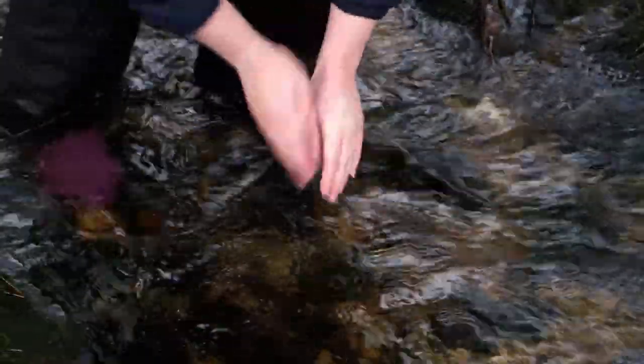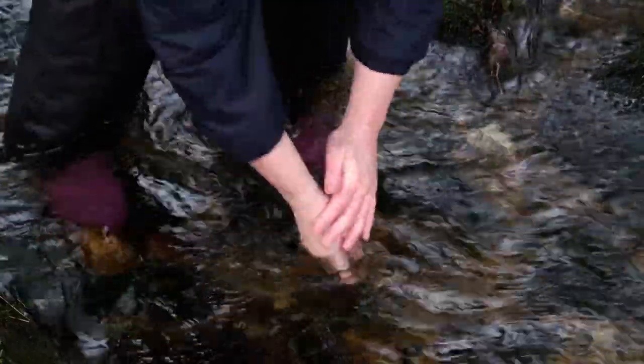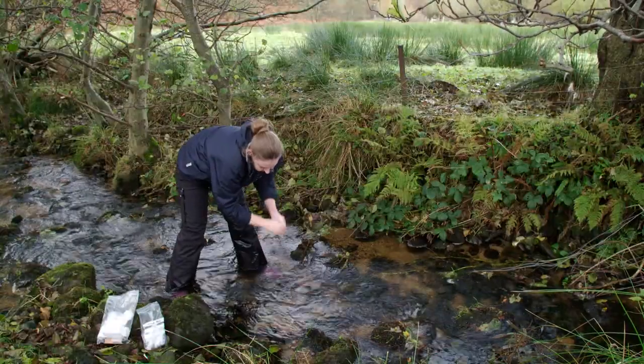Wash your hands thoroughly in the stream. Gloves are not strictly necessary and may make handling the containers more difficult.